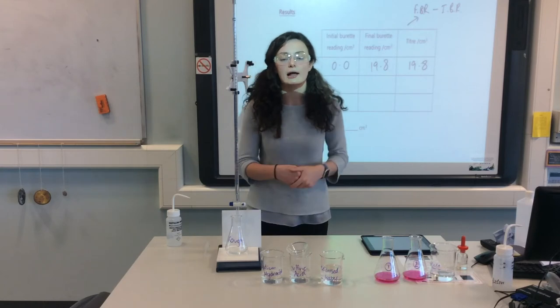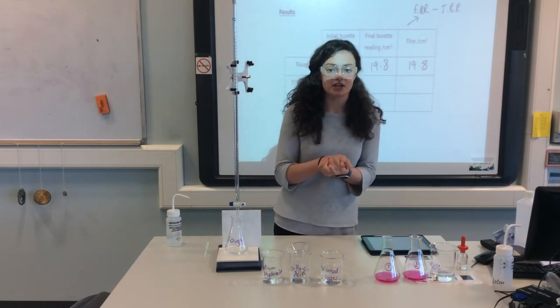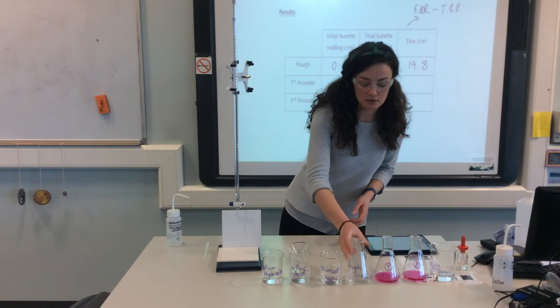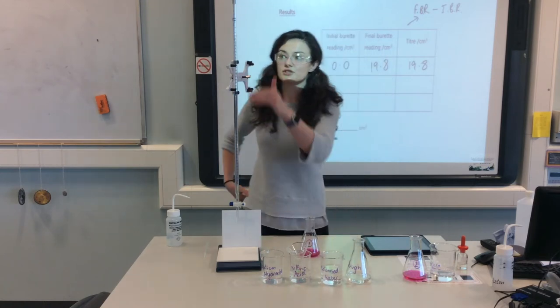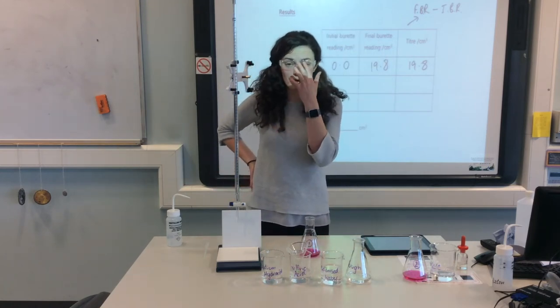But now I want to do it a little bit more accurately to find out what is the exact volume that it changes at. So what I'm going to do is take this away, and then I'll just put it down here and take my first accurate. Now, at this point you have a bit of a choice. What you can do is refill it back up to zero, or we can just continue.